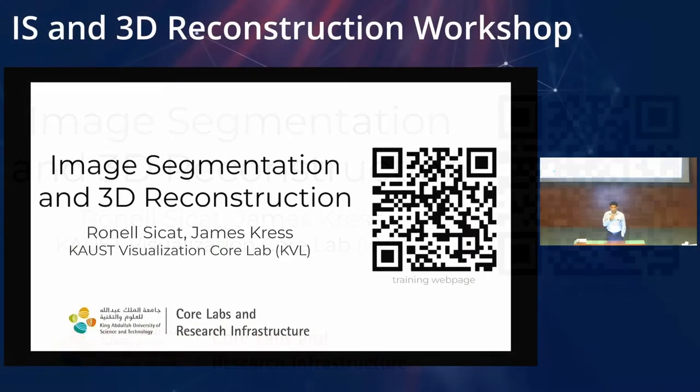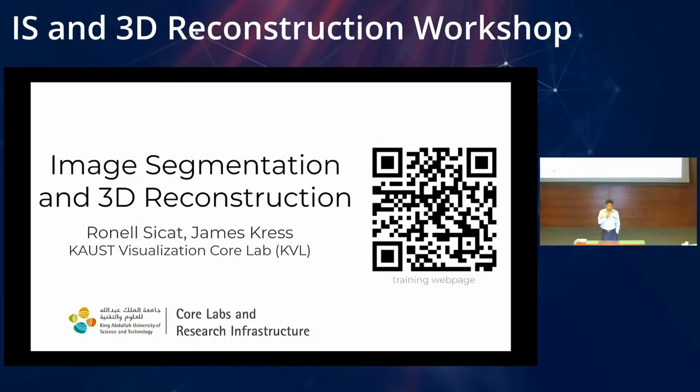Today we will cover 3D reconstruction and rendering using Ilastik and Avizo. Our instructors will be Dr. Ronell and Dr. James from my lab.